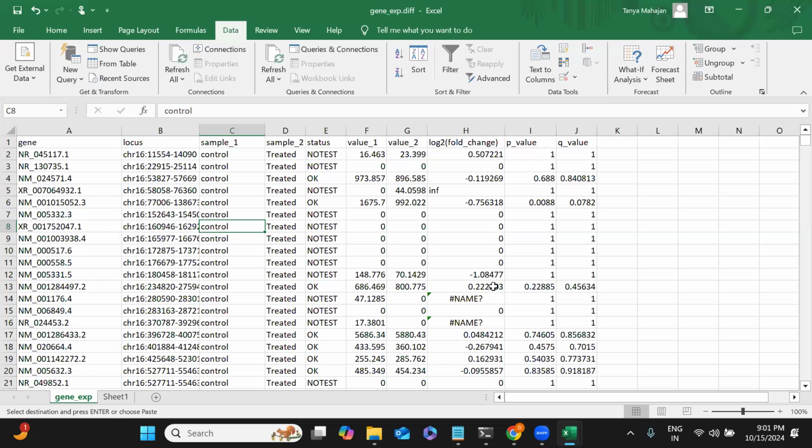We'll end here and I will send you this recording. Just look again at today's session, and in tomorrow's session we are going to do the annotation part, and we will sort and see how many genes are showing significant expression in our data, and which genes are upregulated and downregulated. We will see that in tomorrow's session, guys. Make sure you save this file in Excel format.